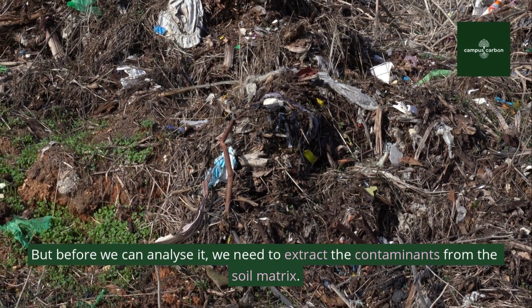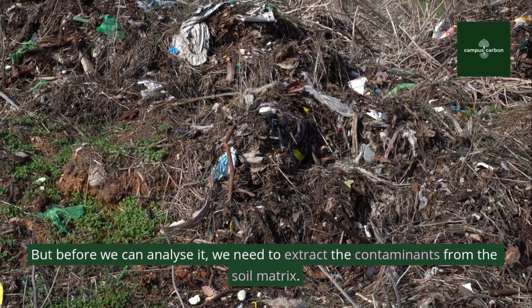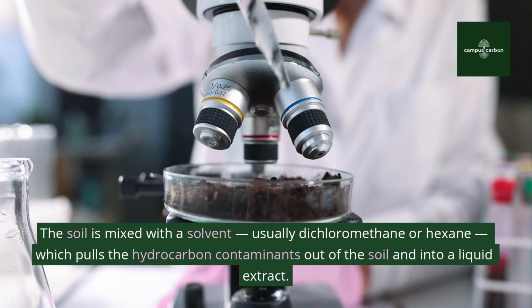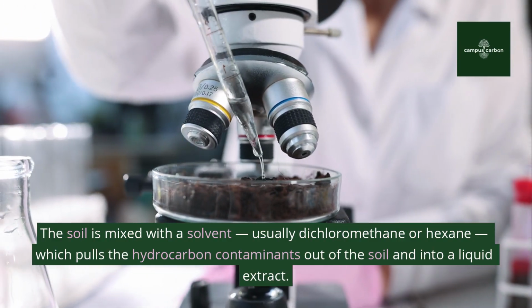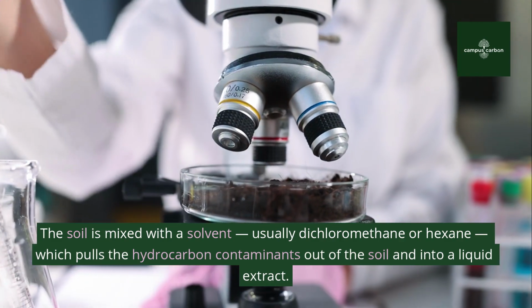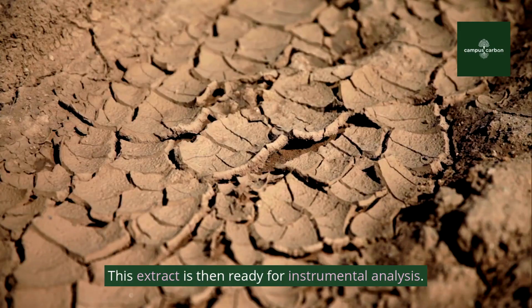But before we can analyze it, we need to extract the contaminants from the soil matrix. The soil is mixed with a solvent, usually dichloromethane or hexane, which pulls the hydrocarbon contaminants out of the soil and into a liquid extract. This extract is then ready for instrumental analysis.